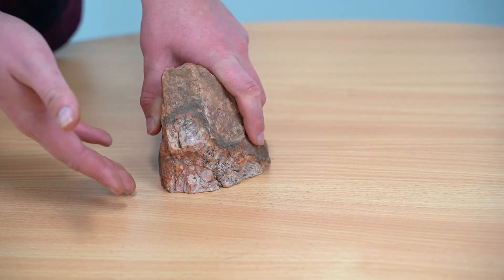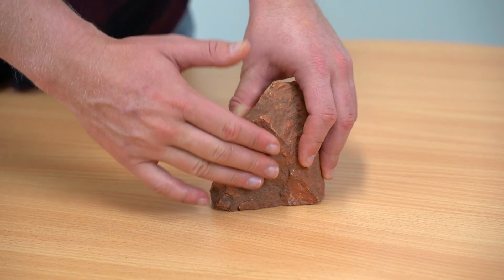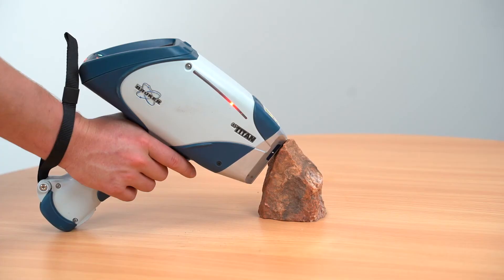When sampling on a rough surface it is more likely for the window to be pierced. To avoid this, try to choose an area that does not have any sharp edges. If this is not possible, hold the instrument just above so as not to pierce the window, but be aware that the quality of your data will be reduced due to the gap between the instrument and the scanned area.